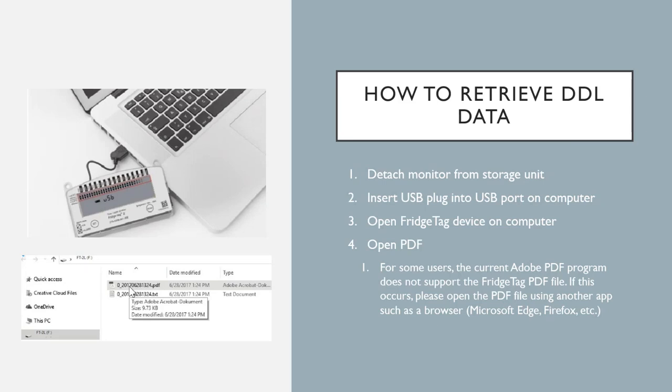So in the event that this happens, you're going to have to reach out to your IT or systems for your facility to get that taken care of, because it's pretty essential to be able to just plug in your DDL when you need to, barring any kind of excursions. Next slide, please.